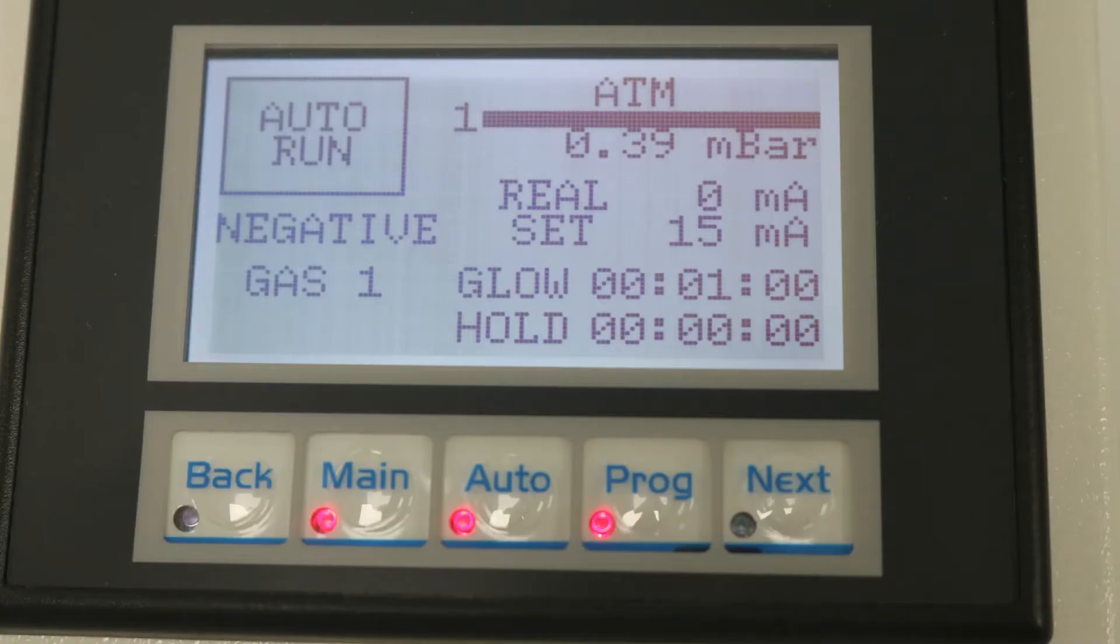Check that the screen shows the following text. If not, consult the manual. Run the automatic program by pressing AUTO RUN on the touch screen.